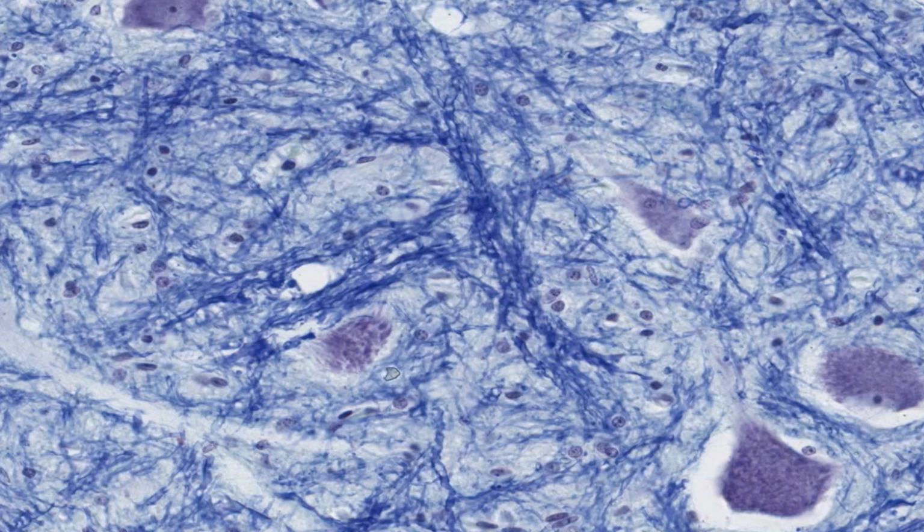Glial cells perform many of the duties that connective tissue does in other tissues of the body. The central nervous system has only a very small amount of connective tissue and collagen. Most of the small, seemingly bare nuclei scattered throughout both white and grey matter belong to glial cells.